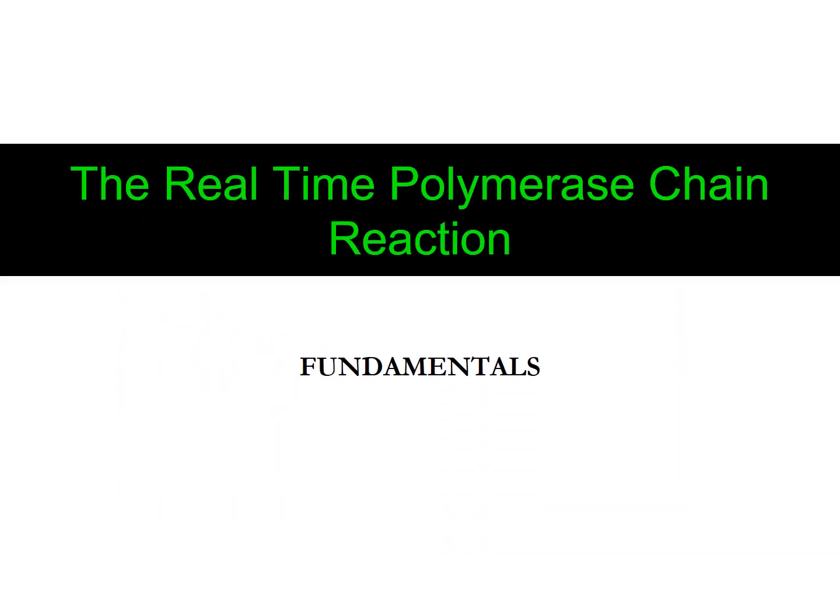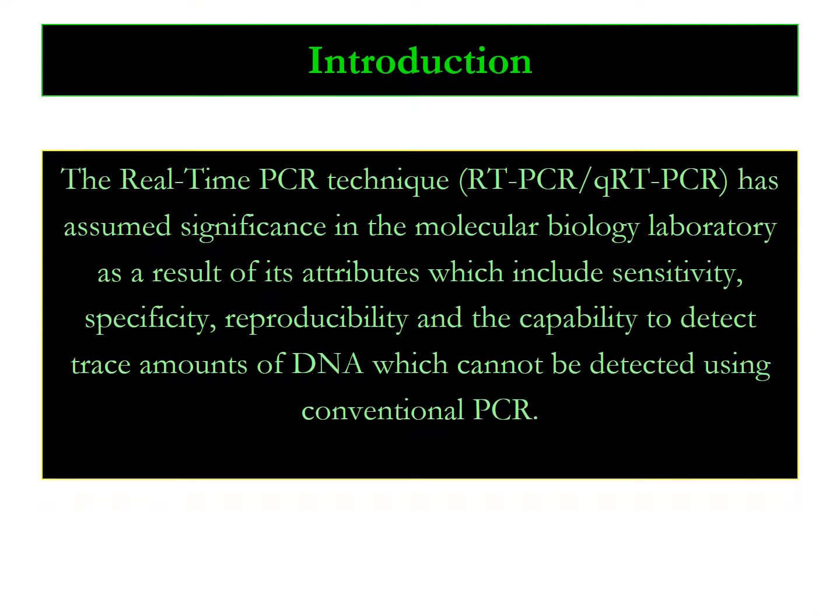Today's lecture will focus on the real-time polymerase chain reaction. This module will focus on the fundamentals. The PCR reaction, which is designated as RT-PCR, qRT-PCR, or RT-qPCR, has assumed significance in the modern molecular biology laboratory as a result of its attributes, which include sensitivity, specificity, reproducibility, and the capability to detect trace amounts of DNA which cannot be detected using conventional PCR.